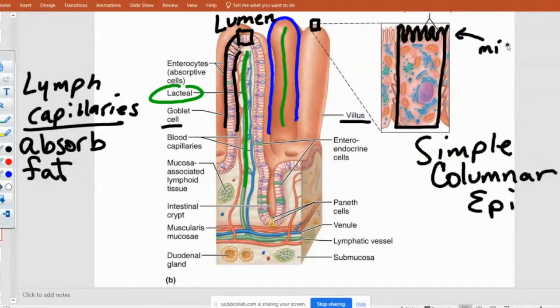That would be the microvilli. They are just the tips of the column-shaped cells. So if now you'll be able to see it. That's what it would really look like.